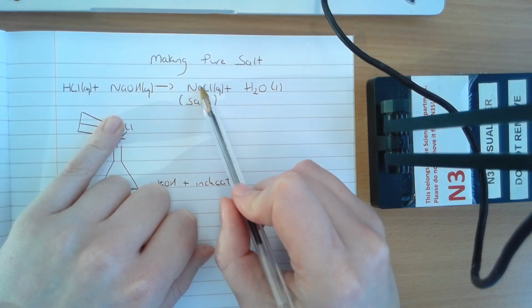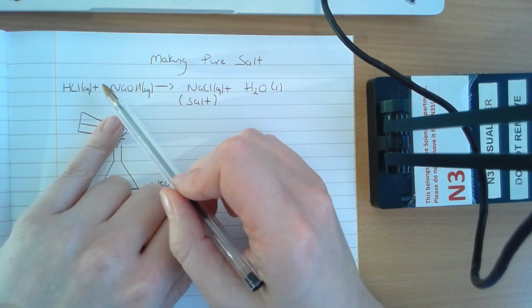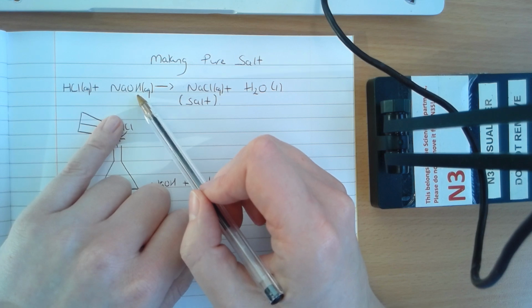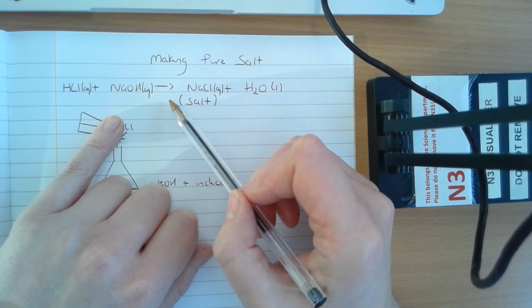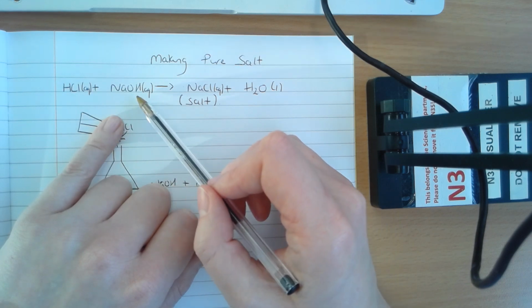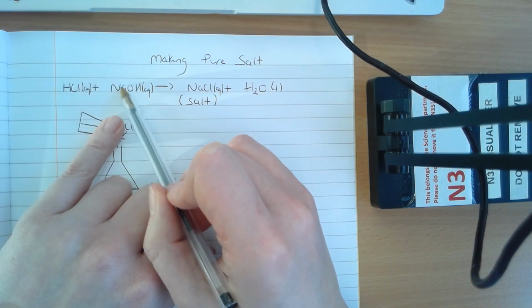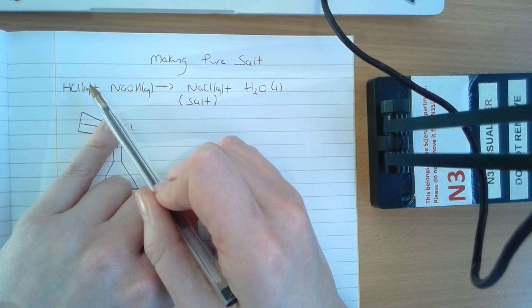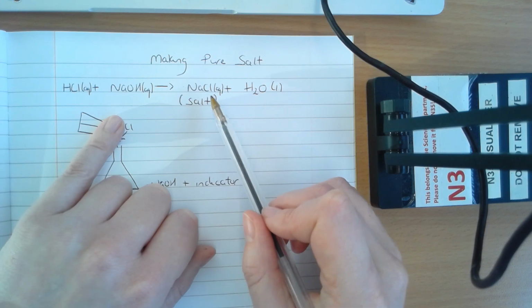Now, in order for this to be pure at the end, the HCl and the NaOH need to react with each other in exactly the right quantities. And to figure out when the reaction is done, I'm going to be using an indicator. The color change will tell me when the reaction is complete. Once I've just got salt and water, because these have reacted in exactly the right quantity so they're no longer present, I'll be able to just evaporate the water and be left with a pure salt.